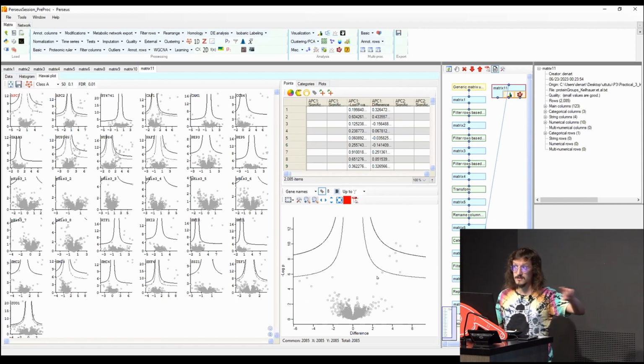If you remember, it was in the presentation, the one referring to the profile plots, where the different profile plots were compared to see which was the correlation between them. Because here we have 4 very strong interactors, and we're kind of sure that they form a complex. But we have then other 4 here, and what can we say about them? Are they specific binders, or maybe they're just noise, unspecific binders that end up in such large quantity that we may think that they are specific binders?